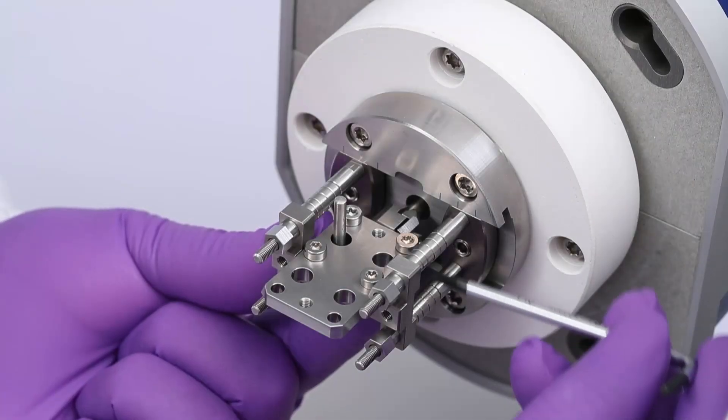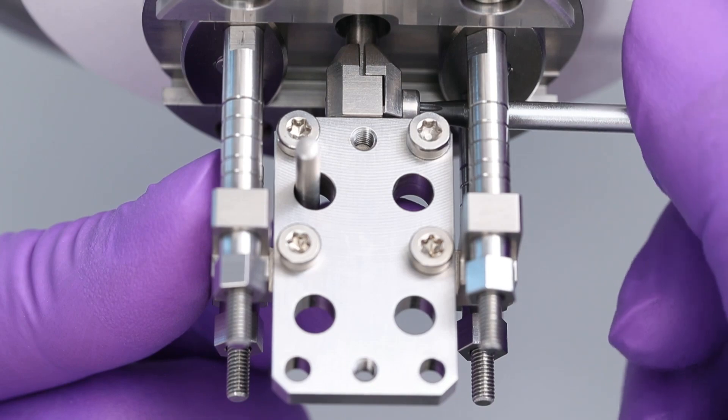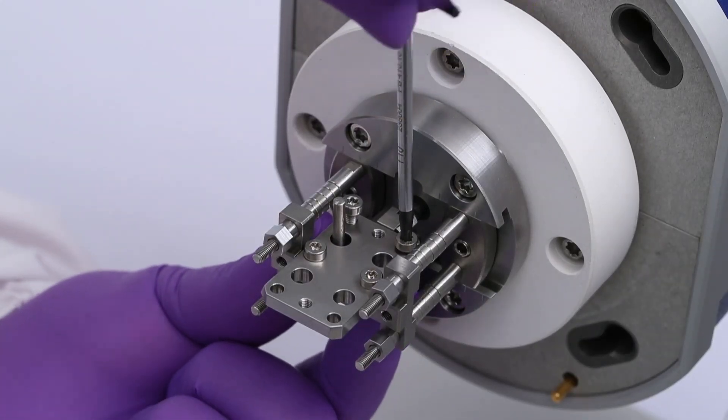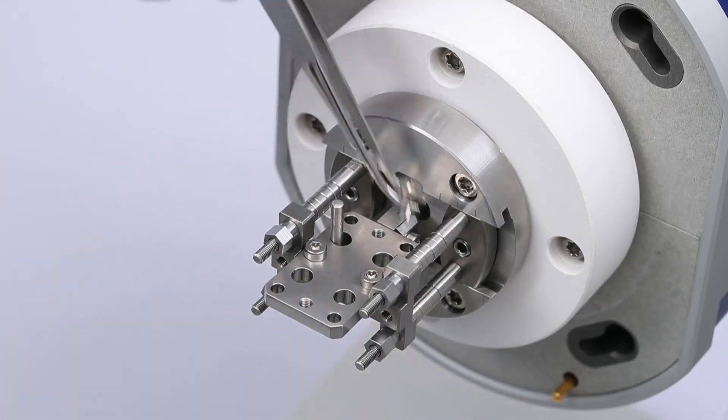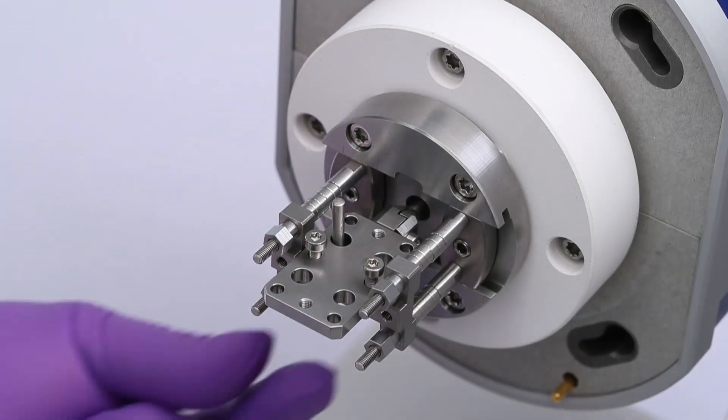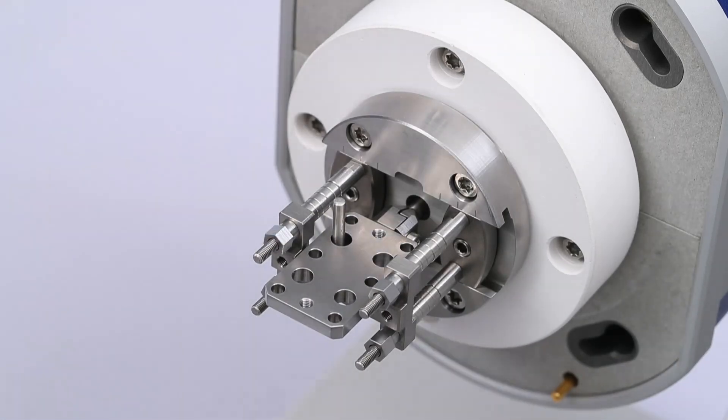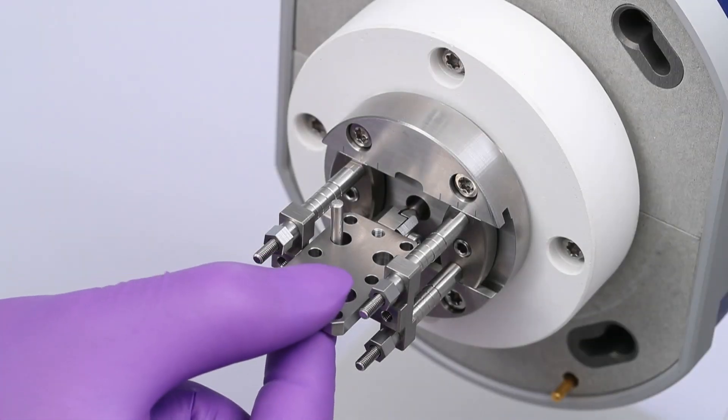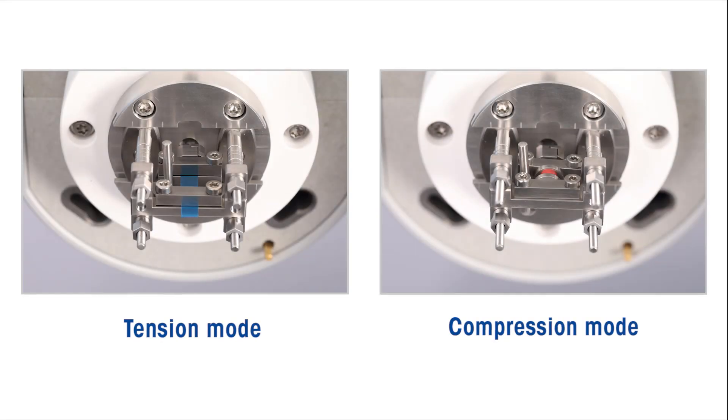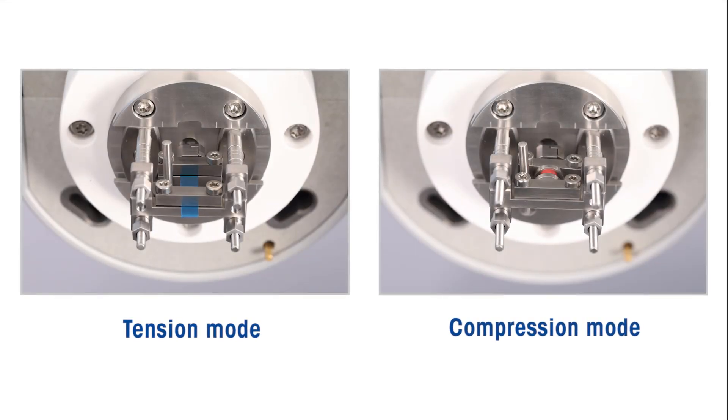Secure the drive shaft part of the tension clamp by fastening the securing screw. Take out the two torque screws on the drive shaft side of the alignment insert before removing the remaining two torque screws. Detach the alignment insert. The tension or compression drive shaft clamp is now installed.